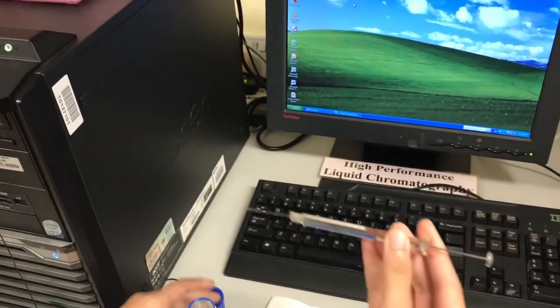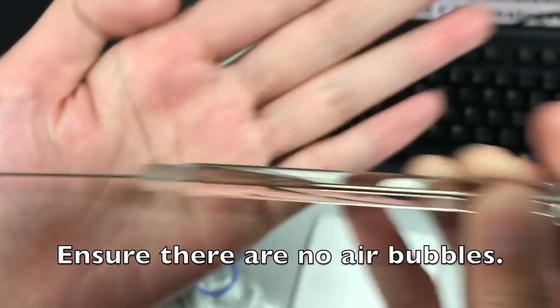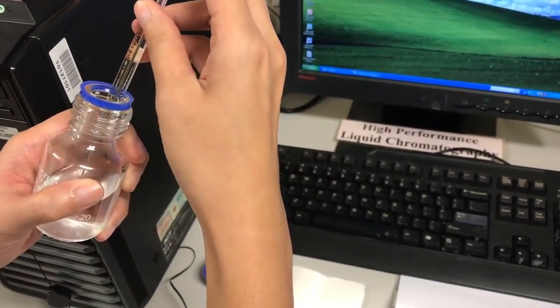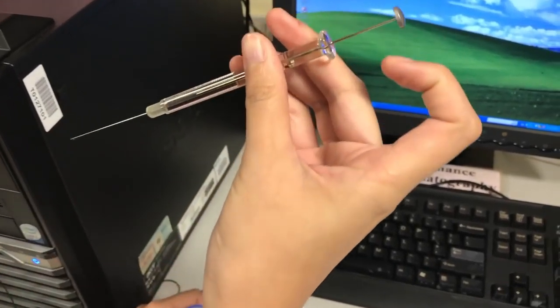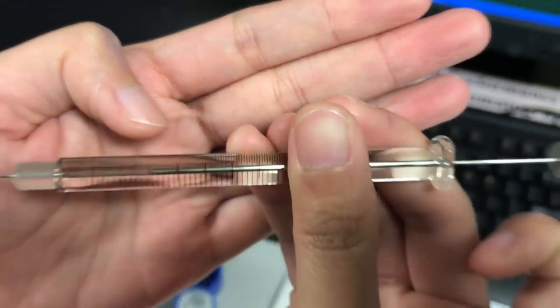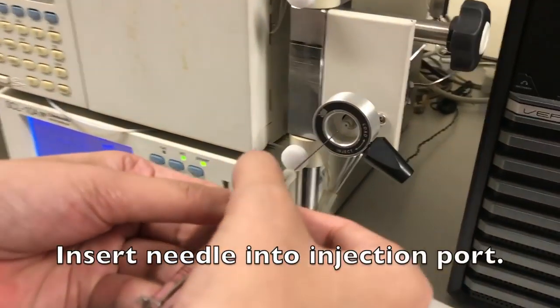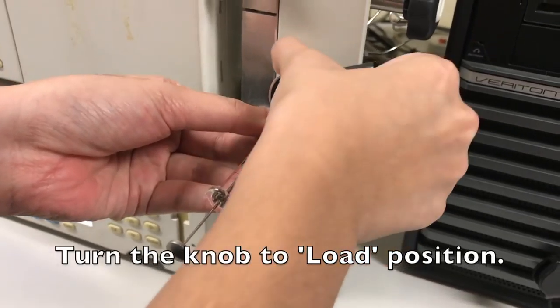So if there is an air bubble, discard, retake. Only inject the sample when there is no air bubble. Take your sample and come to the injection loop. First, you have to put your needle in, then lift up to load.